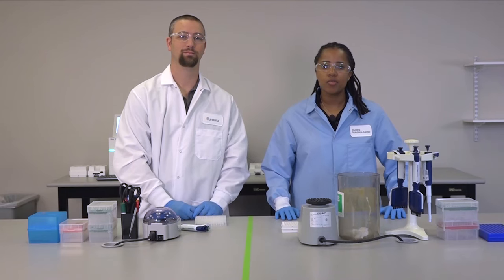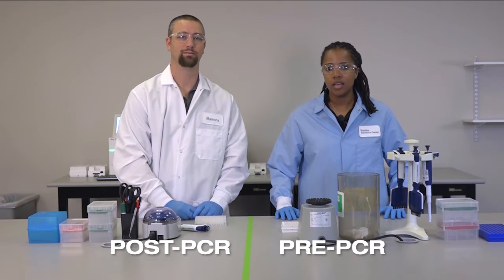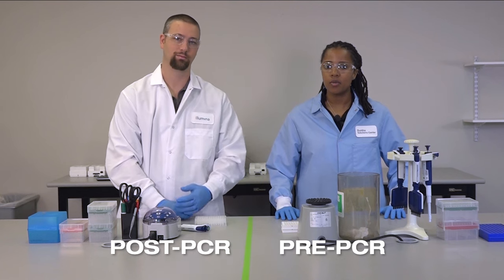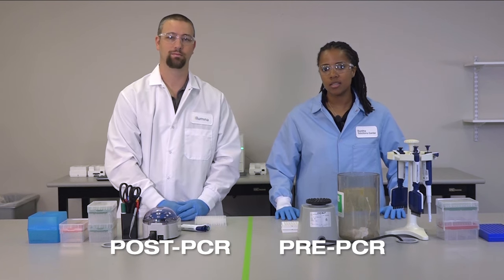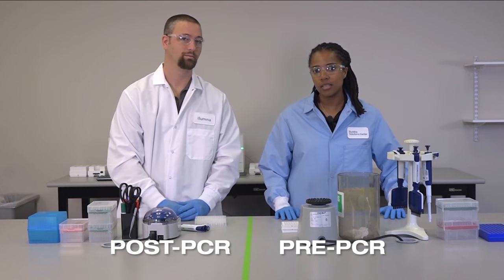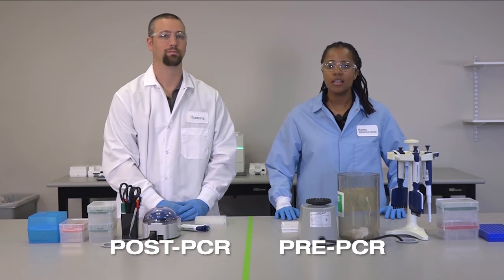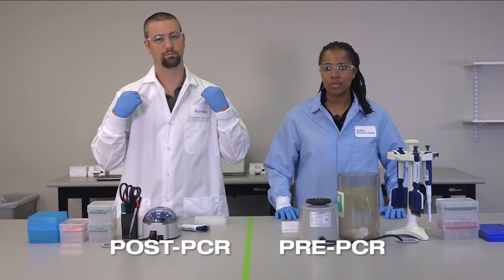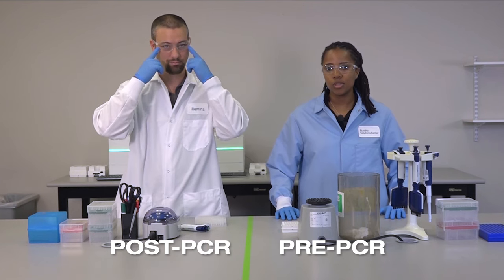If using two separate rooms is not an option in your facility, separate benches or areas are acceptable if separate equipment is used for pre- and post-PCR processing, and different personal protective equipment, or PPE, is used in both areas. This would include items such as gloves, lab coats, eye protection, disposable shoe and boot covers.